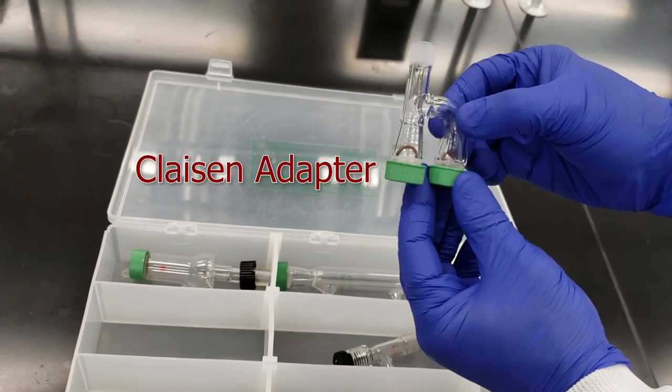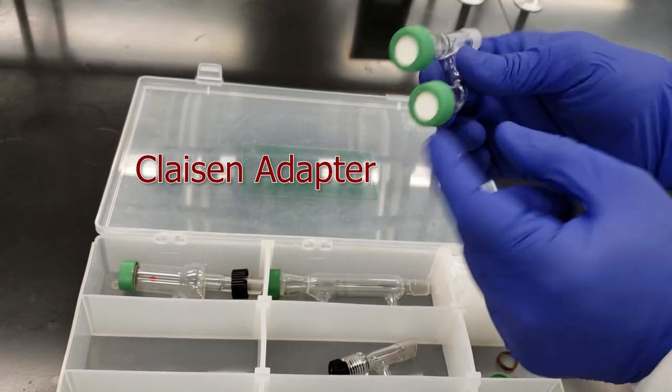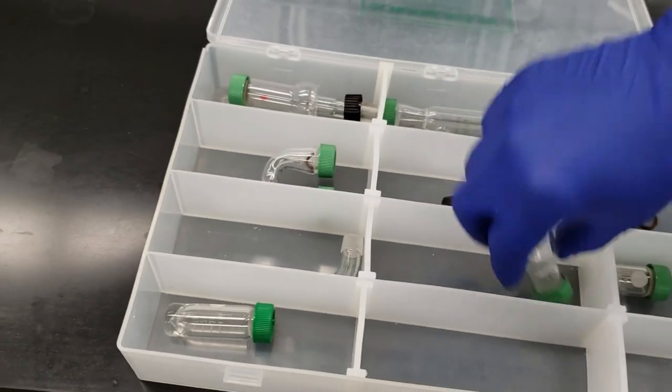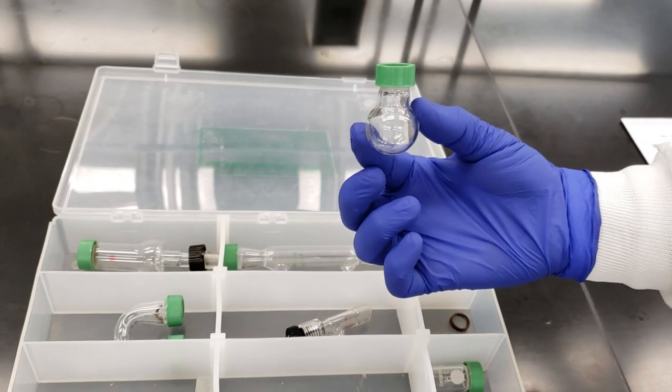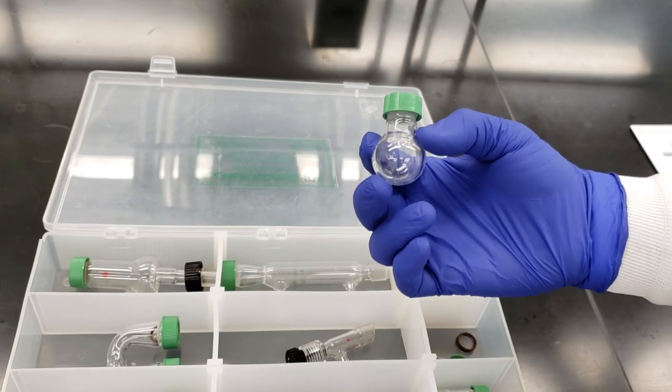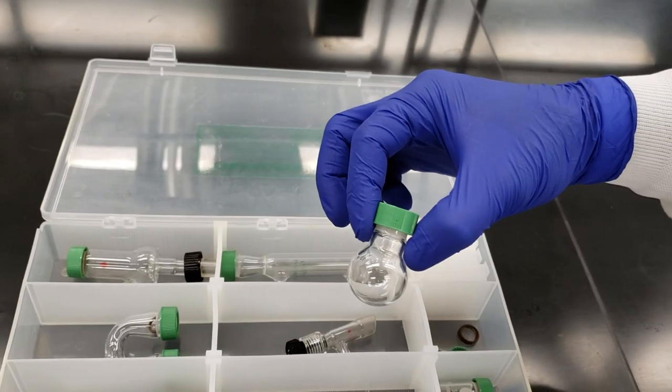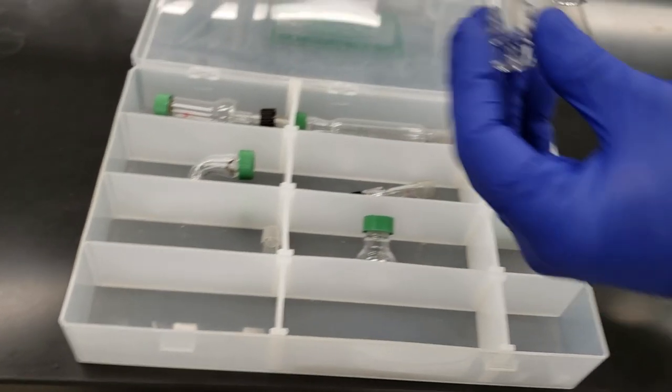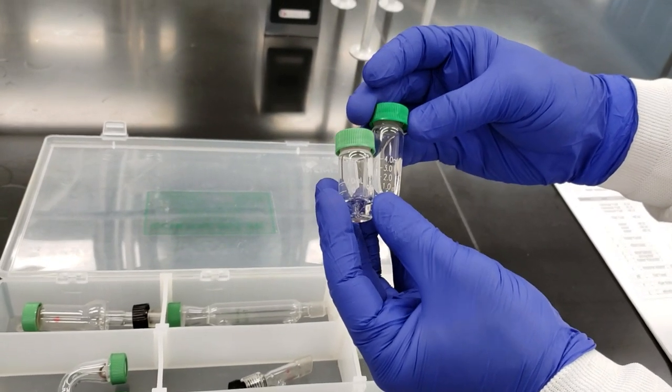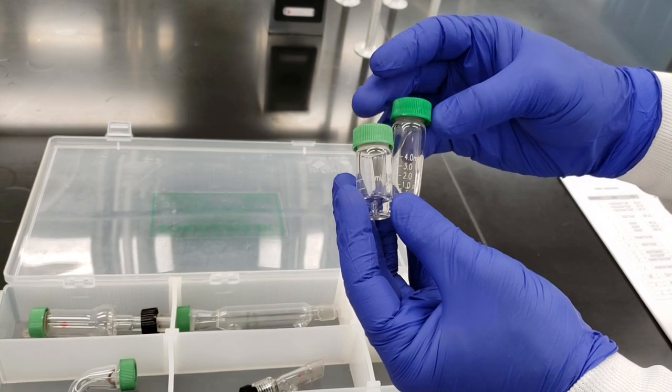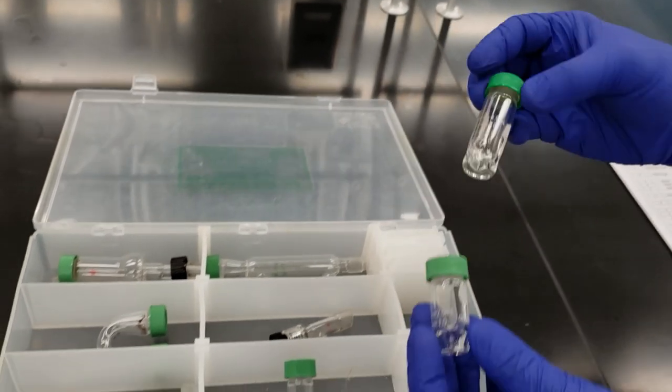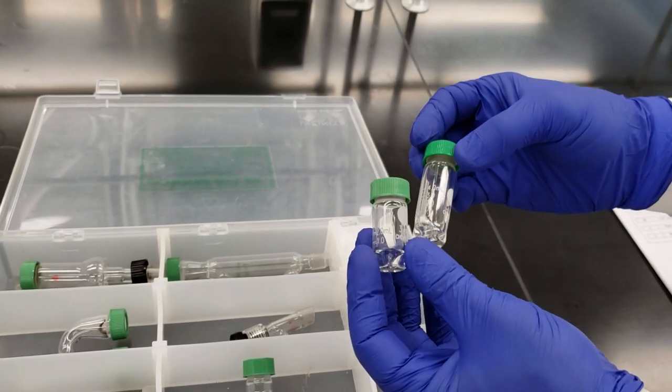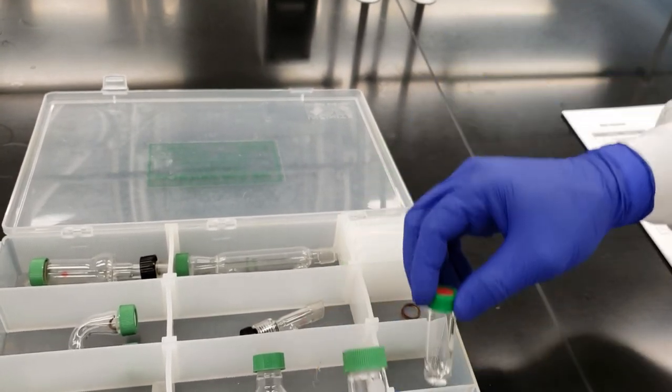We have a Claisen adapter complete with O-rings and caps. We've got a 10 mL round bottom flask, the smaller counterpart to the 24/40s. We have two conical vials, a 3 mL and a 5 mL, which we can heat in or use as containers for products or liquids.